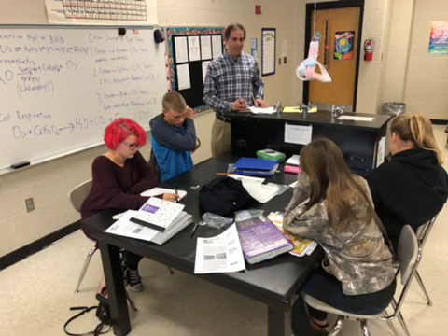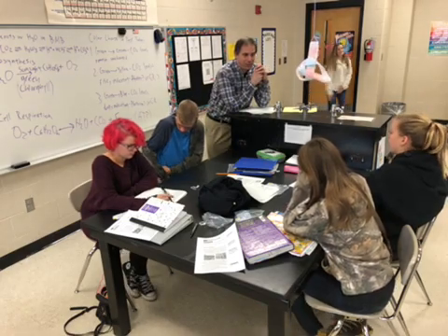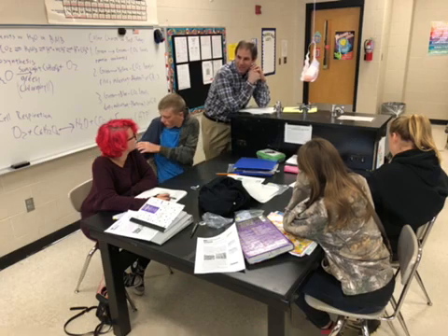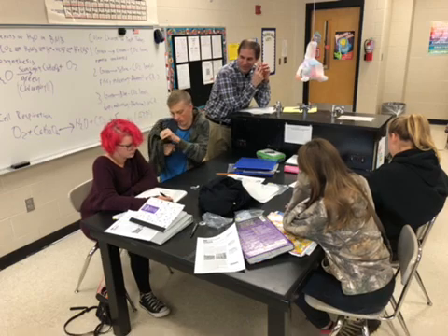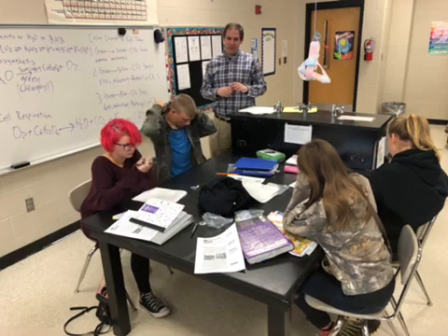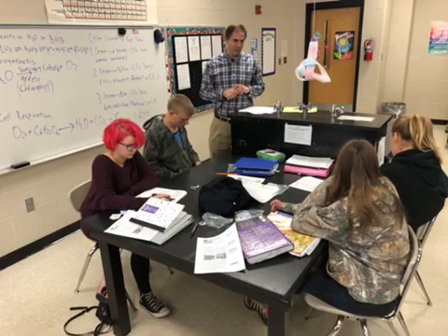Now, one important thing to keep in mind is that when plants perform cell respiration, what type of evidence will it give us? What was the evidence that they would give? Actually, you got it right the second time. Very good. It goes from green to what colored solution? It's going to go from green to yellow. So, as hard as it is to believe, yes, folks, plants can perform respiration just like we do, although it's not quite as noticeable.